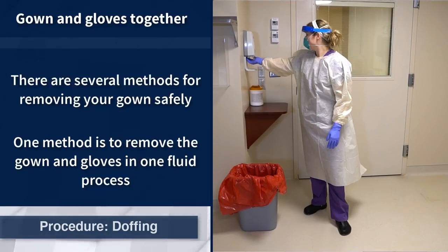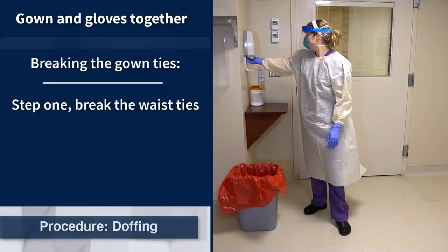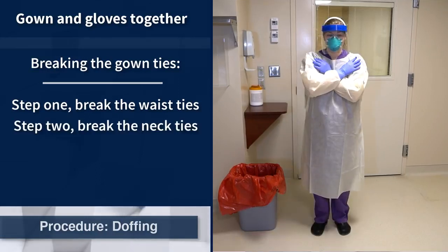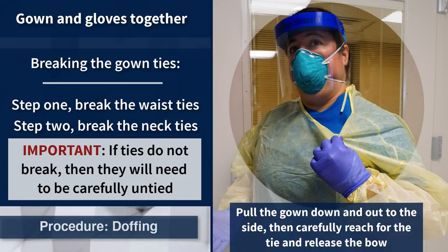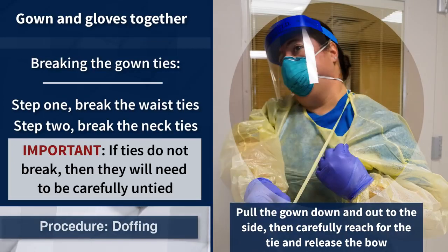There are several methods for the health care worker to remove their gown safely. One is to remove the gown and the gloves in the same process. Begin first by pulling at the gown's midsection to break the waist ties. Cross the arms to grasp at the front of the gown below the shoulders and pull the gown firmly away from the body to break the neck ties. If the gown does not tear away or the ties do not break, the health care worker will need to safely untie the neck and back ties, ensuring they do not touch their clothing, skin, or hair with the gown's sleeves. This can be achieved by reaching behind the head to undo the tie or by pulling the gown forward and to the side away from the face to bring the tie into reach.